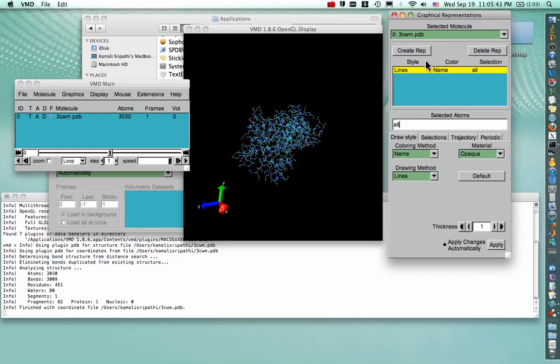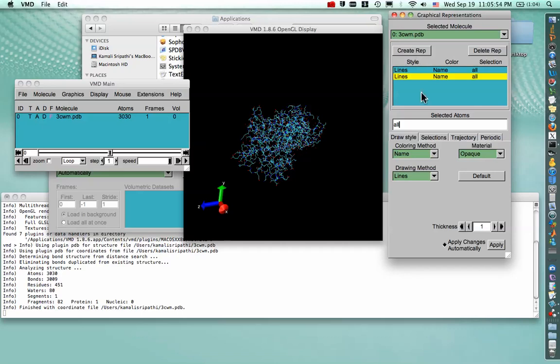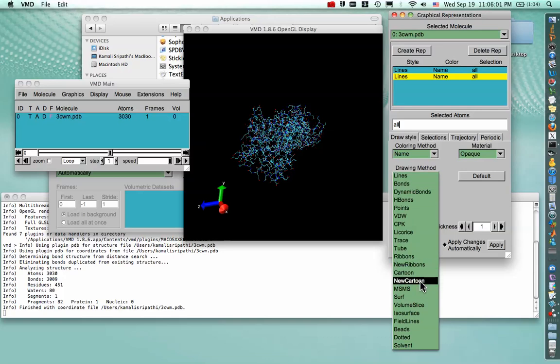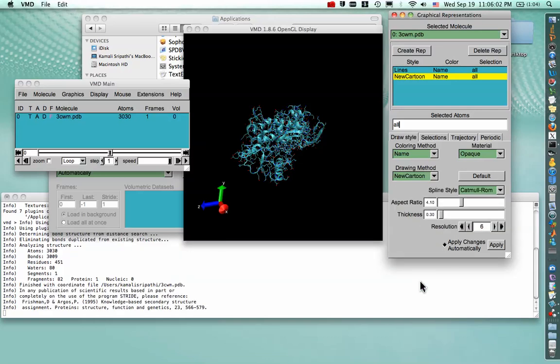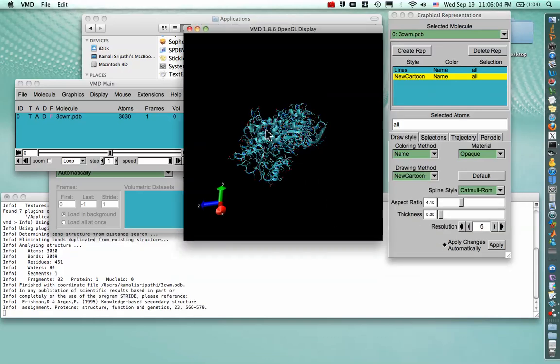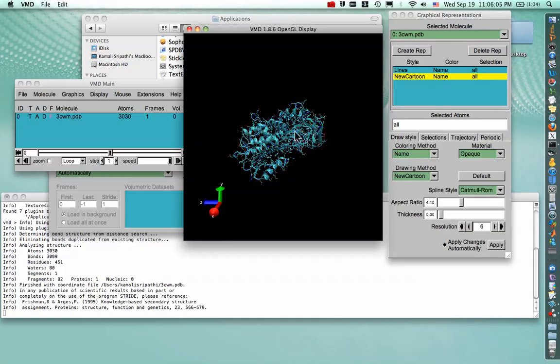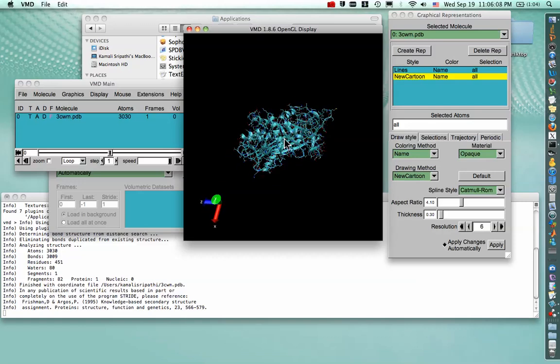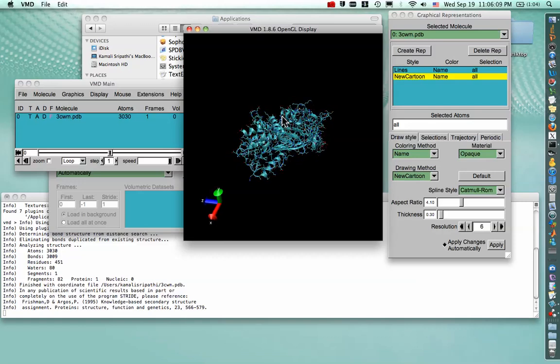So to show the structure in Cartoon Representation, we want to click again on the Create Rep button. And to change the drawing method, we go to this drop-down menu here and select New Cartoon, which, like PyMOL, shows the alpha helices and those lovely coils, and then there's our familiar beta sheet again.